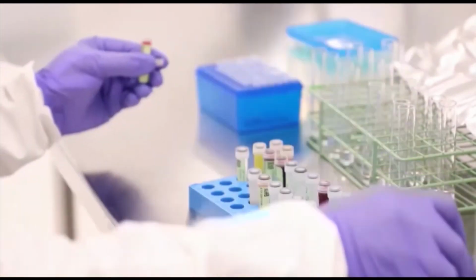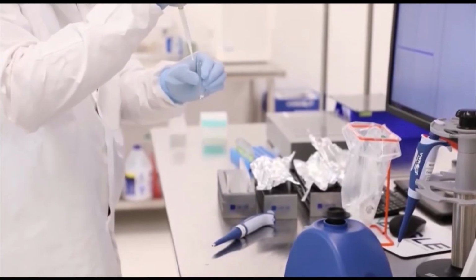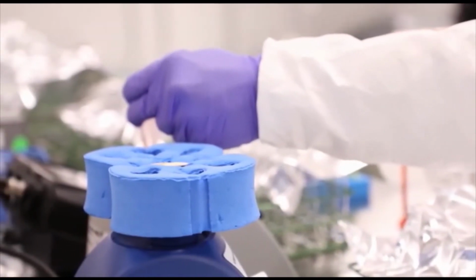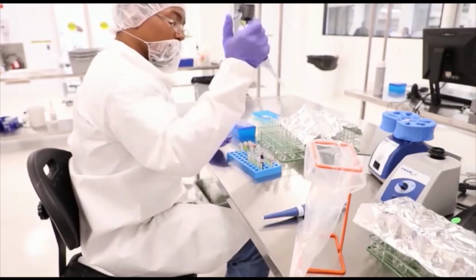They're a complex of lipopolysaccharides released when the cell lyses. Mostly they come from contamination from water, during prepping and making sterile injections as well.